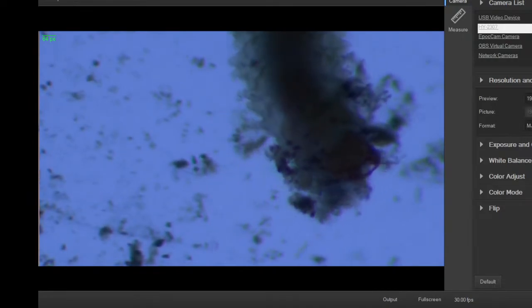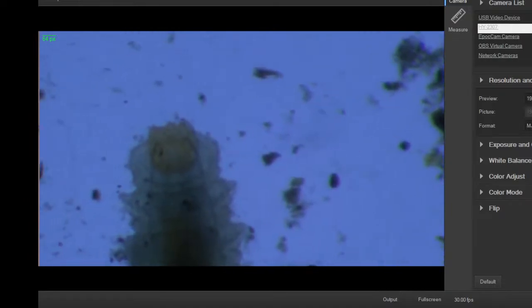Pretty cool though. You can see little black eye spots there, the pincher mouth parts. The body's pretty opaque, I can't see much going on inside there. But it's definitely a larval stage before it gets to be, we have a bunch of moultings and then they become an adult with proper six legs, exoskeleton, instead of this kind of caterpillar stage. There's little legs there on the body. Larval stage. Not that head though. Little orange head. Little black dots for eyes.